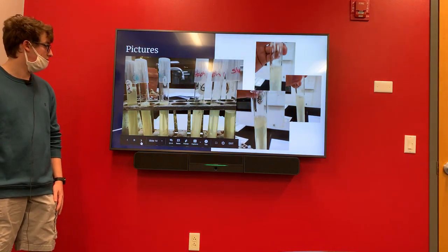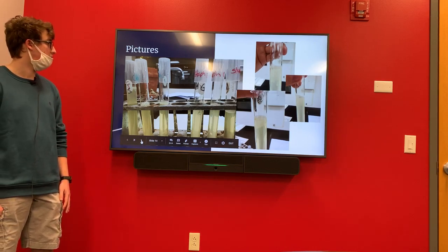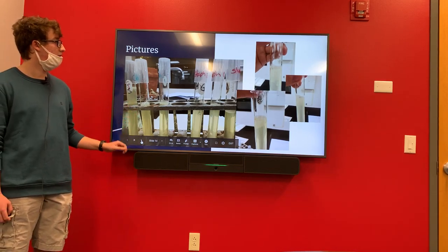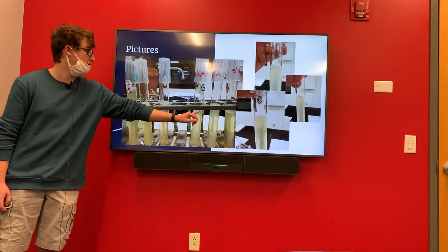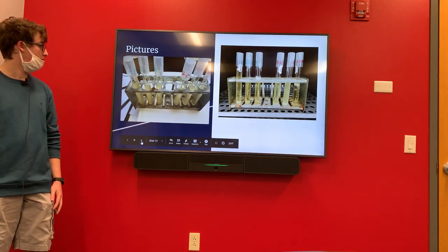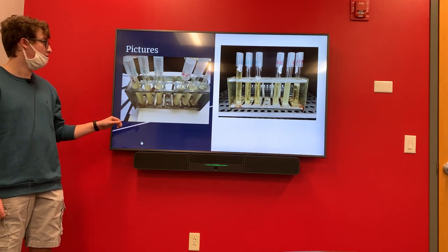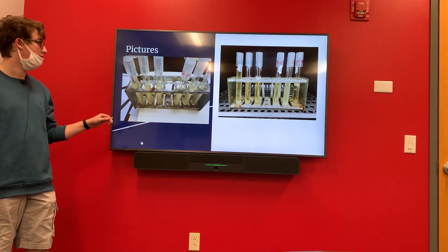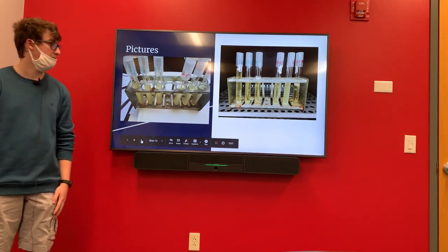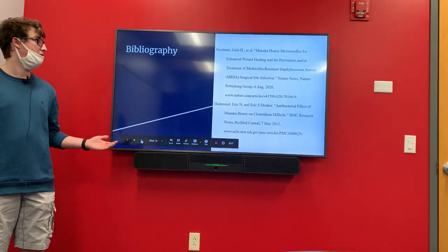Here are some pictures of the bacteria after growing for a day — here is the Clostridium and then the Staph. Here is day three after adding the honey, and then day four.